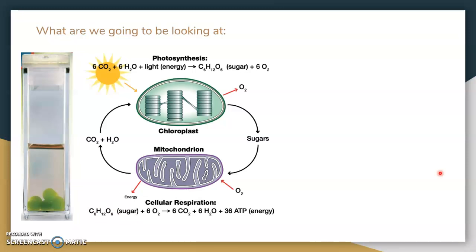So take a second and think about what are the two gases that are nonpolar that can be emitted in cellular respiration and photosynthesis. So after thinking about it, you should come to the conclusion that oxygen could be emitted that we could analyze coming out of the environment, or CO2. So these are the two ways that laboratory experiments analyze the cellular respiration rate or photosynthesis: by either looking at CO2 levels or looking at oxygen levels. They just pick which gas they want to analyze, and that's what they do.